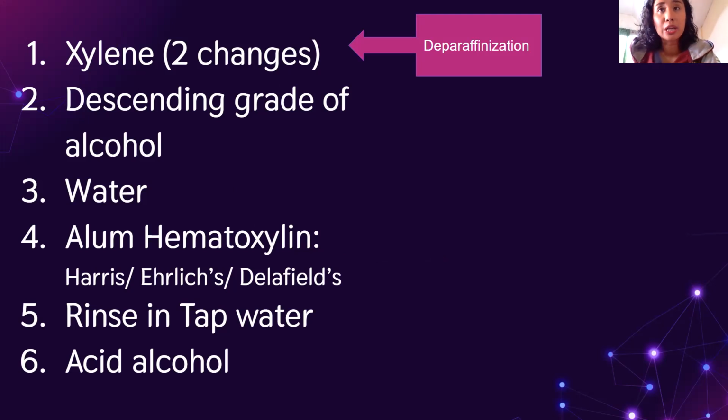So nakatali na tissue section. Why? Because paraffin cannot be stained, so it must be removed. Pag meron pang paraffin wax na natitira, guys, sa tissue natin, hindi yun masistain, or may patches of paraffin. So we could remove the paraffin through 2 changes of xylene.